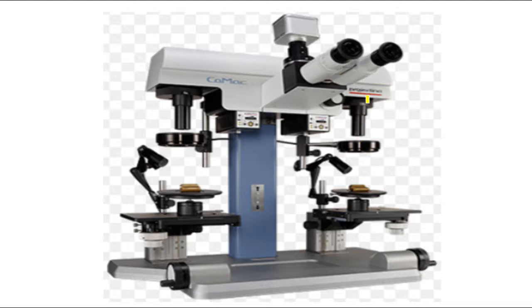Part of what you're going to be looking at is this sample, and the other part you're going to look at is this one, and you can compare the two based on what you see in here. And of course, when it's all magnified, you can tell, let's say, tiny scratches in here and compare them to tiny scratches in there and see, well, maybe they're from the same piece. Or maybe you could just look at the very edge of this, see if it matches up with the very edge of that, and see if the pieces are actually one and the same, or they're completely different. Many things you can learn from it. Just a little bit more of an idea about how this works.